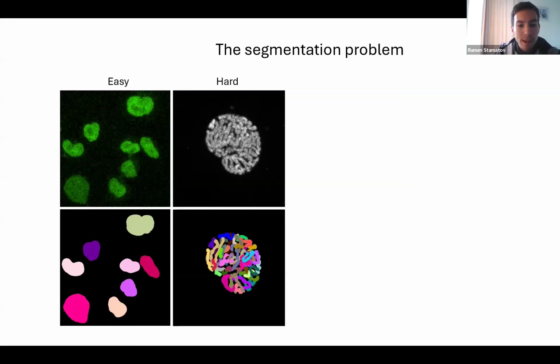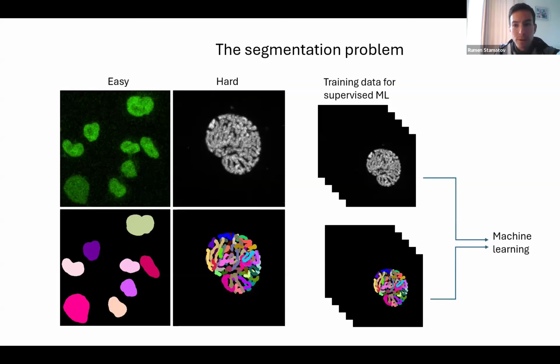So in order to do this, we need to have some machine learning model, but even that will probably make mistakes. And actually, the idea of training a machine learning model involves lots of data, which, especially if it's a supervised network, in order to train such a model, first we need to make sure that we have sufficient amount of data. And to do that, we have to go through manual segmentation. So either as a pre-processing step or as a post-processing step of a specific machine learning model, sooner or later, we're going to have to go through manual segmentation.